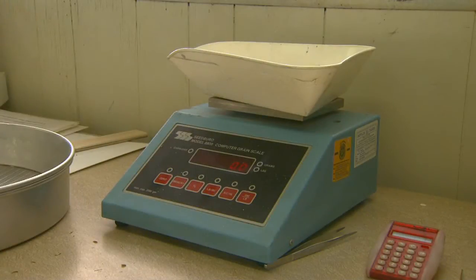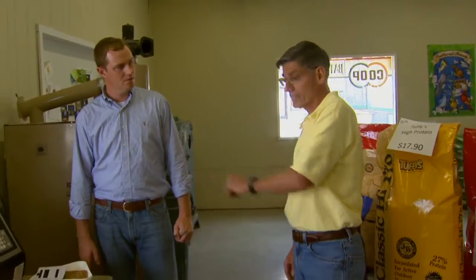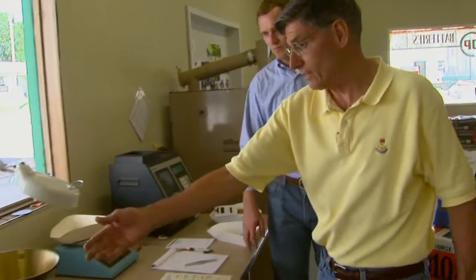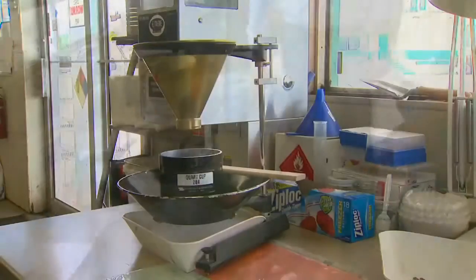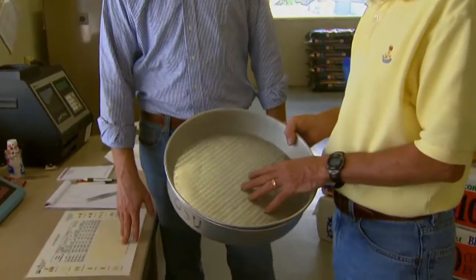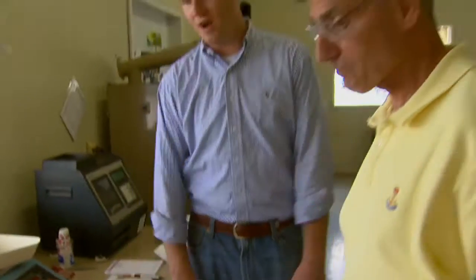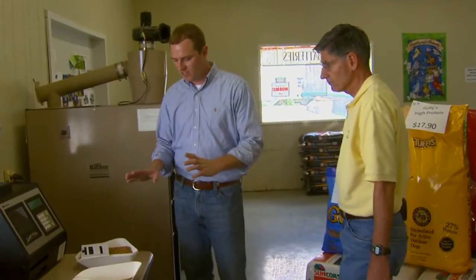They'll either do the test weight with the moisture meter, and you always do the test weight with the moisture out. If they don't do the test weight there, they'll use a fill hopper and cup with a striker and do the test weight there. Sometimes they will need hand pans with slotted sieves, but most generally these machines take care of most of that. These are the basic tools you're going to see when you walk into your elevator and bring a sample.